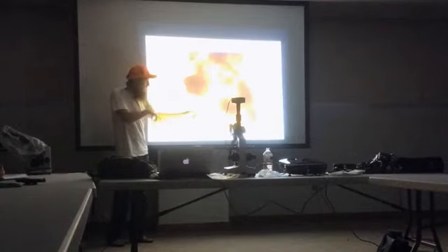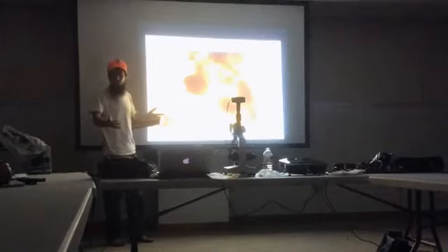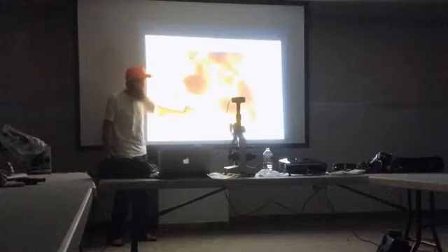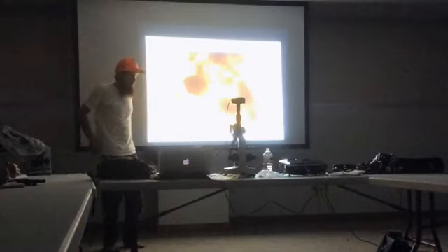So you use this tiny, like 1 bacteria to get your scale, and then you measure, okay, so that it's wide enough, right? If it was only half that size, I would say, oh, that's not a beneficial one, because I can see that all the way across.